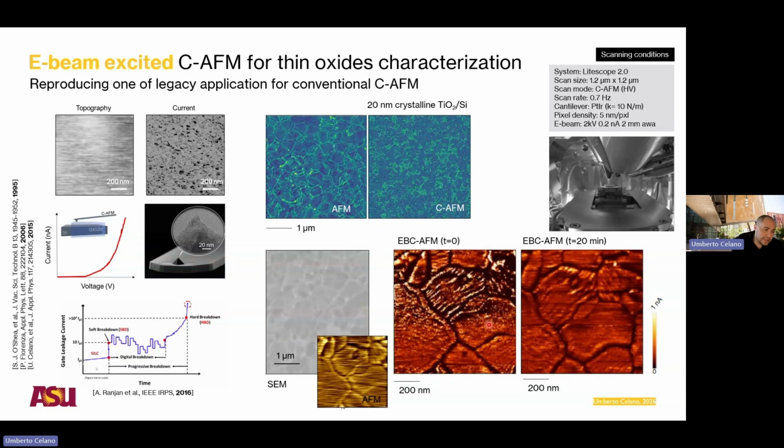So if I had any sort of in-plane conduction for my charge, that would definitely not show up like here with the appearance of all your grain boundaries, or the increase in conductivity in proximity of the edges, or the increase of conductivity in proximity of these kind of surface defects in individual crystals.